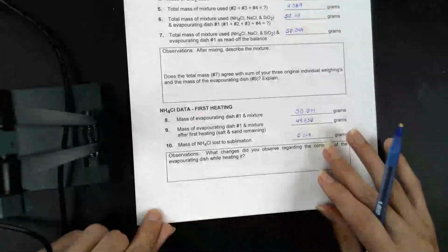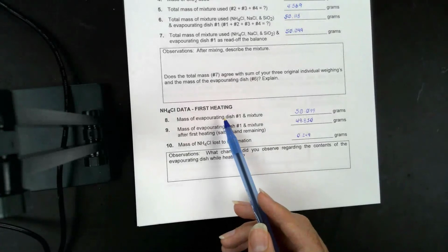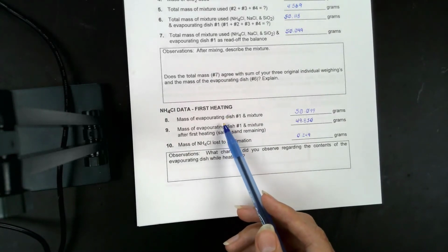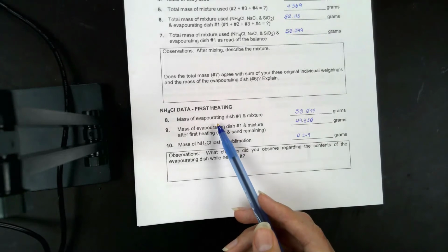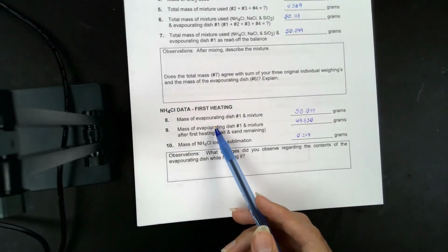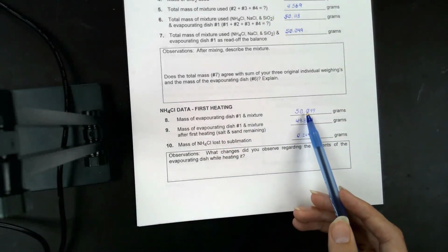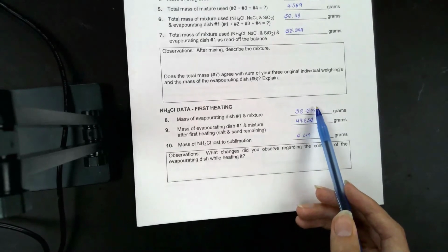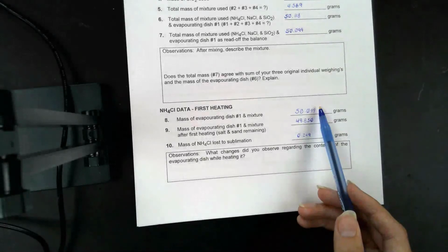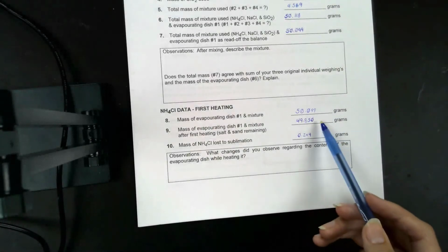Down here at the bottom of the first page of your data sheet, you've got the data for the ammonium chloride. So if you remember, I heated the ammonium chloride. I got that white gaseous evolution of ammonium chloride gas, and then I removed that dish from the heat, from the flame. So item 8, that is the mass of the evaporating dish plus the mixture. So it's the same thing as item 7. You're just bringing it down one.